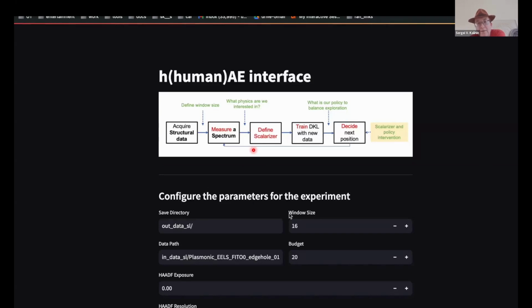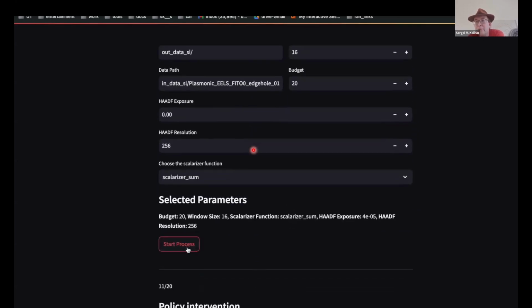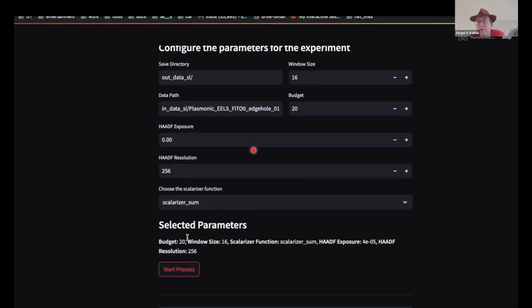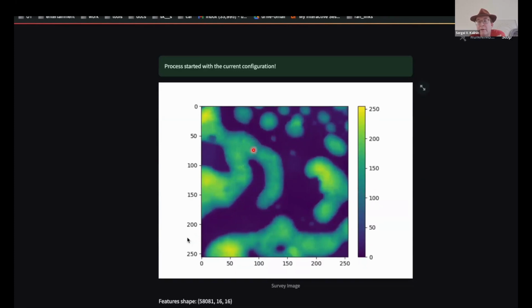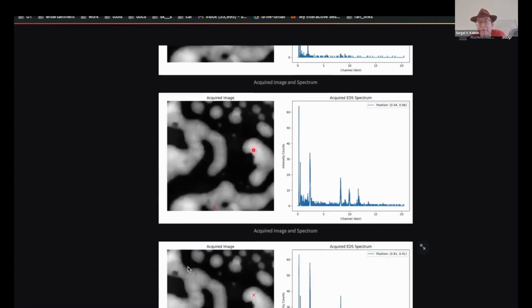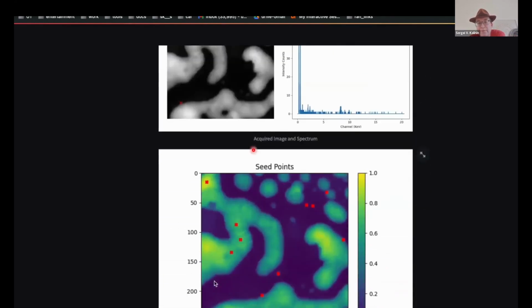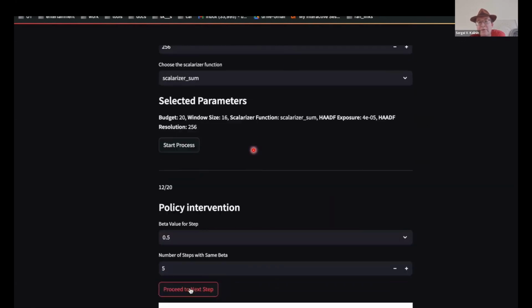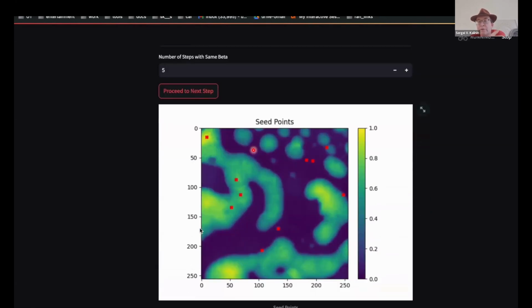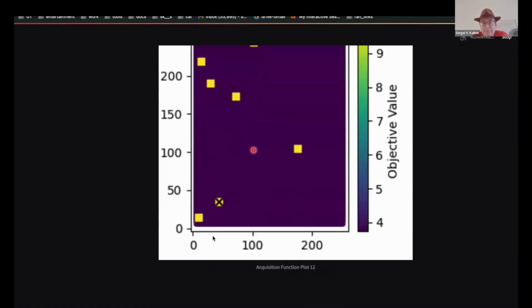And this can be implemented in real time. So obviously I cannot show you the human-in-the-loop workflows running on an actual instrument, but this is the recording of the ML agent running the spectra. So it runs the instrument for several cycles, and then the human observes the progression of the experiment, and the human can decide to intervene on the reward function or intervene on the exploration-exploitation balance.